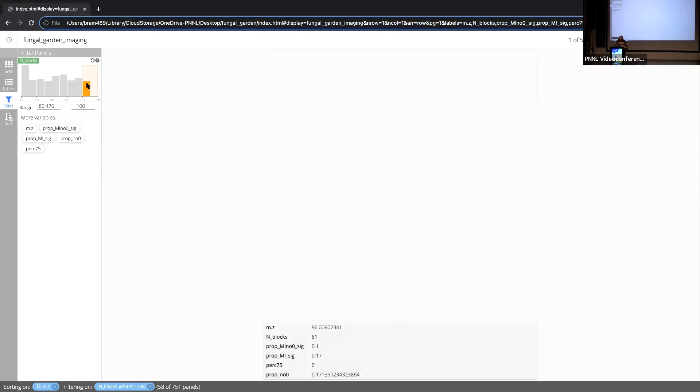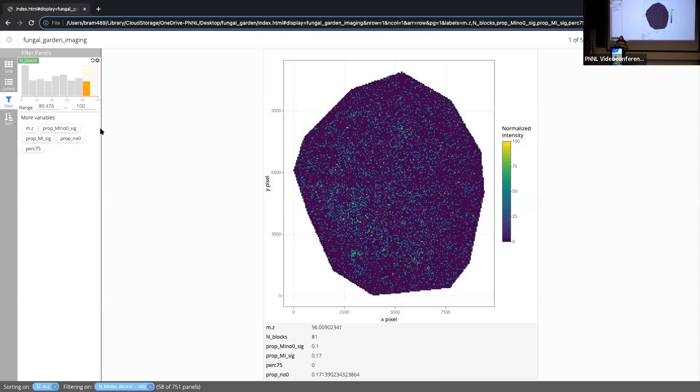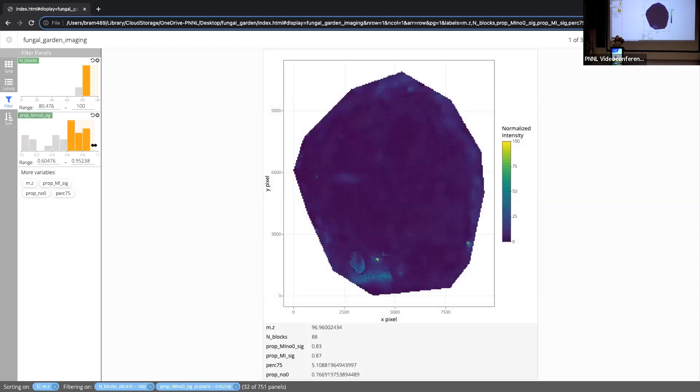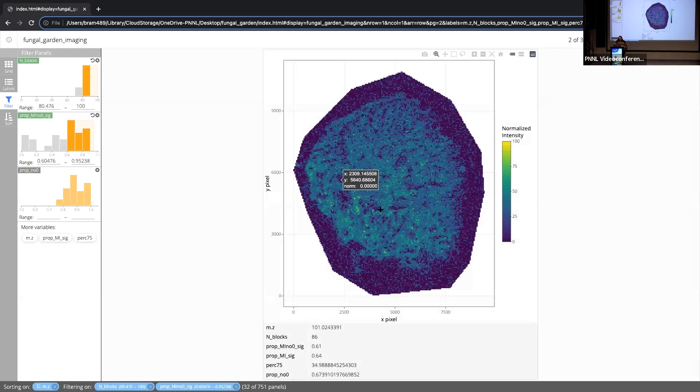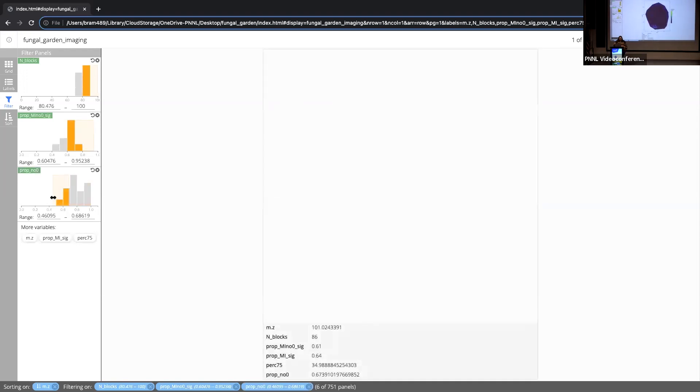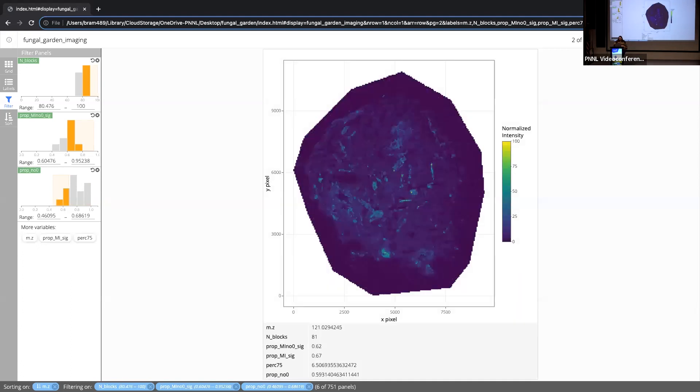And I counted how many of those blocks had intensities greater than zero across them. So basically a metric of how much data is there. I could look and I could come into Trelliscope. It shows me what the distribution of that metric is. I can come in and say, I wonder what this top section with the most blocks with data in them looks like. And I've now filtered down from 751 plots to 58. These are the 58 m over zs that have sort of collectively the most data scattered amongst these particular metabolites. And I might want to dig deeper. And I just calculated a very basic metric of spatial dependence.